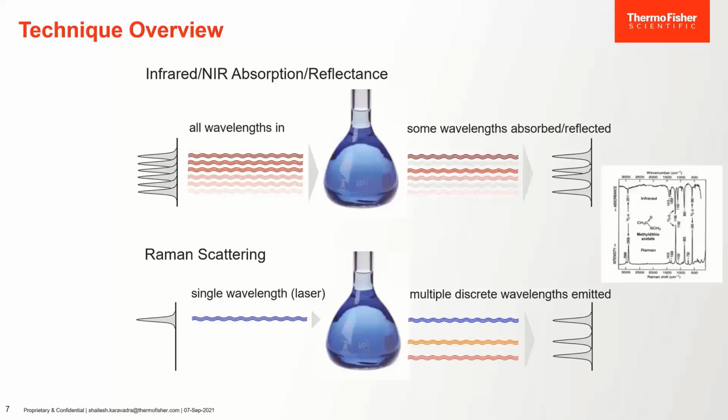There are 4 major sampling techniques in FTIR. You have transmission, a classic method, which is done by doing a background first and then the sample. It's very low cost, and you can directly correlate that to the measurement that you are doing. For example, the concentration of a liquid, or the concentration in a matrix like a gas. If you have a mixture of gases, you can directly correlate the concentration of a single component, and it is also used for solids and liquids.